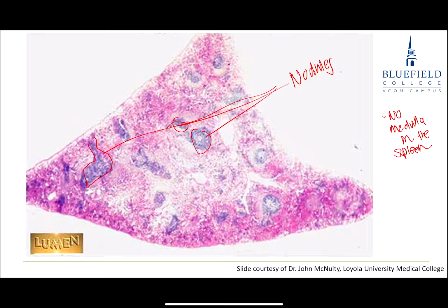Okay? Now, if you look right here. This is one where I say spleen doesn't jump out and say I'm spleen, but if you look at this closely, I begin to see, here's the lymphatic nodule right here, the germinal center. Here's the lymphatic nodule, here's the lymphatic nodule with the germinal center up here, so I'm in a lymphoid organ. I come out here, I've got a capsule to it, but I don't have any hint of a subcapsular sinus, do I? Okay, nor do I have any hint of crypts. I do see a trabeculae coming in partially here, but it's not providing lobules. All of these tell me I'm looking at the spleen.